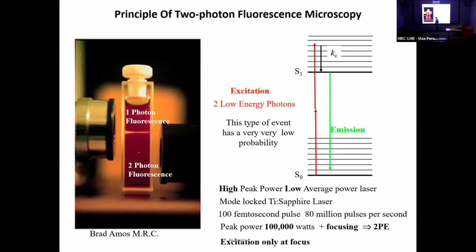That frees you from some quite interesting constraints. Effectively, the scan mechanism tells you where you are in space, and then all you have to do is collect light from that single spot, and that's the information you use to get an image. The difference is that the light is not confounded by a haze of scatter, because if you were including this stuff and this stuff, you would be smearing out the image again. But because you know that the light is coming from a single spot in the focal plane where you know where it is in three-dimensional space, you can get a scatter-free image.